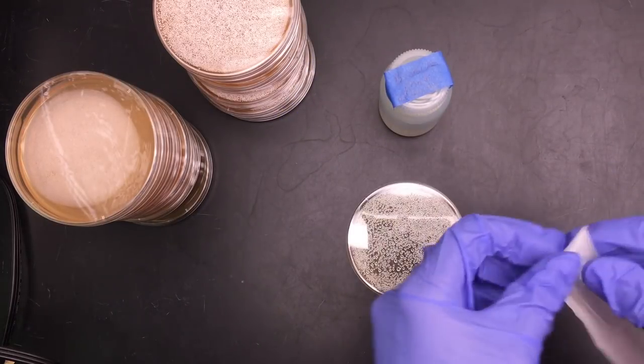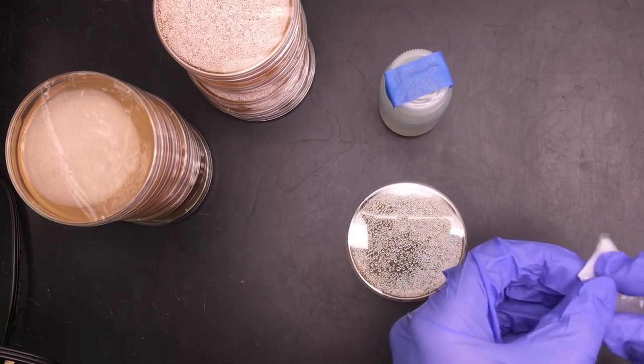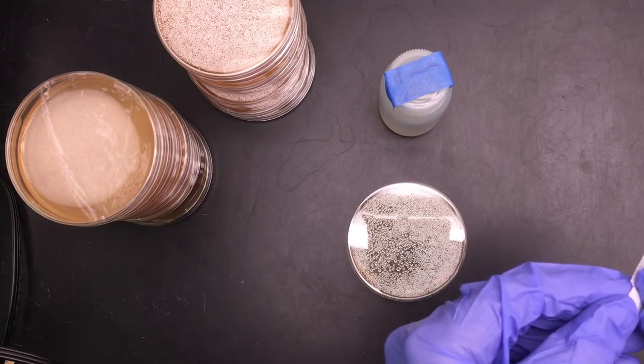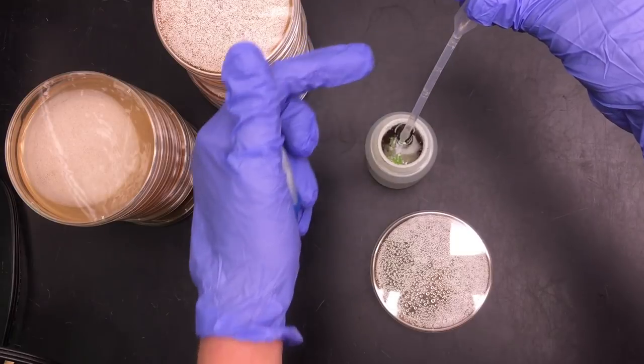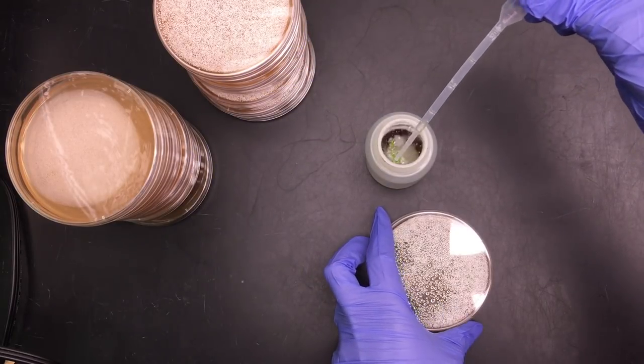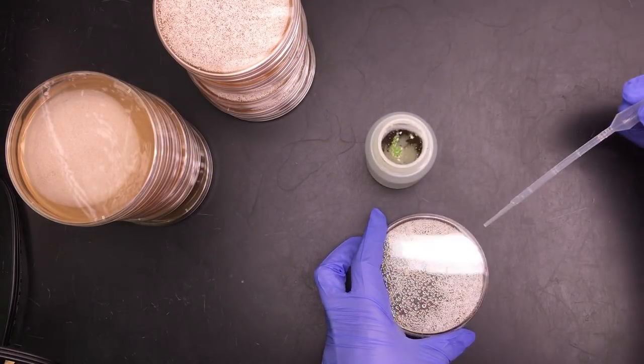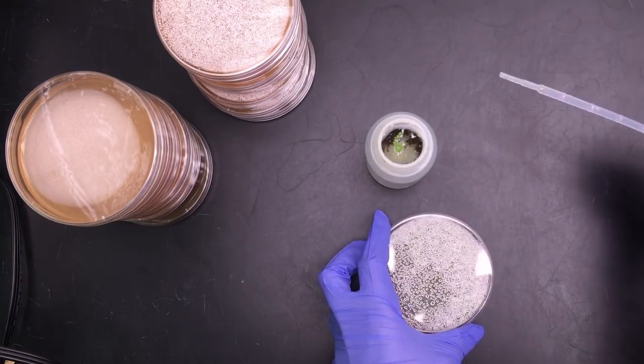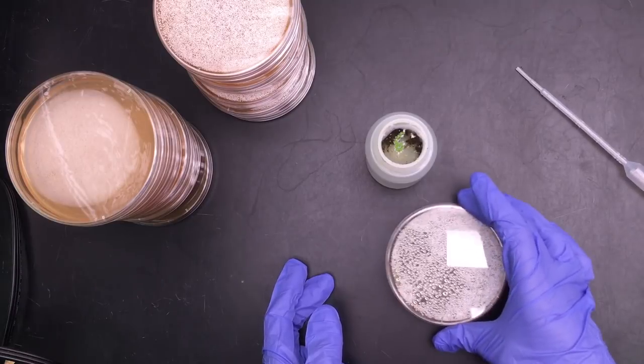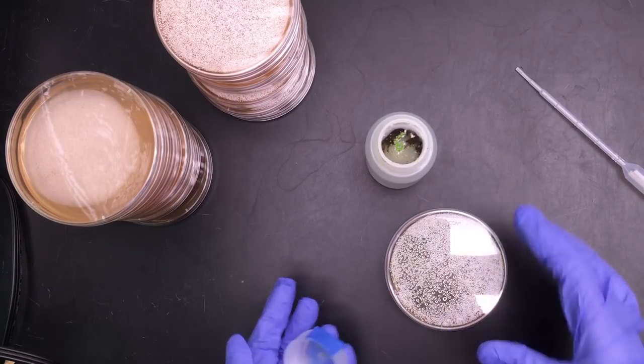So I'm going to take my sterile pipette and I'm going to take one milliliter of the water. The line here is a milliliter. And now I'm going to open my petri dish slightly and put in one milliliter of water and swirl it to cover the agar.